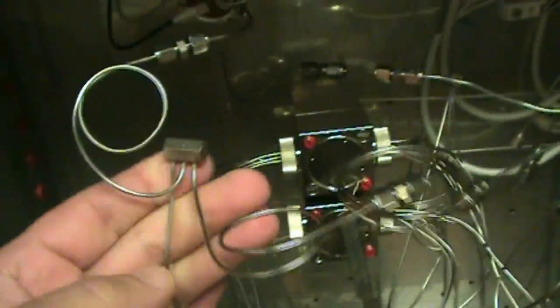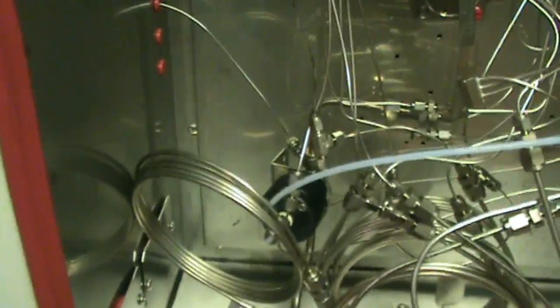Get out of the way. That is your FID. That is a flame arrestor. All right, this is nothing more than a T. I got confused as hell with a lot of the ways that they do things here, but don't let it fool you. Of course, you got your regulator carriers. There's your columns, sample shutoff valve.